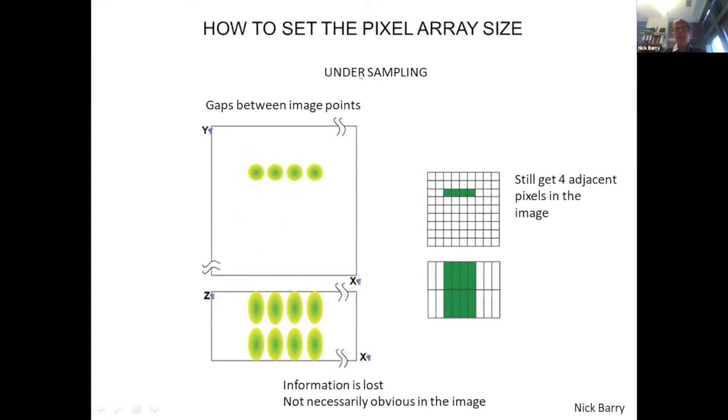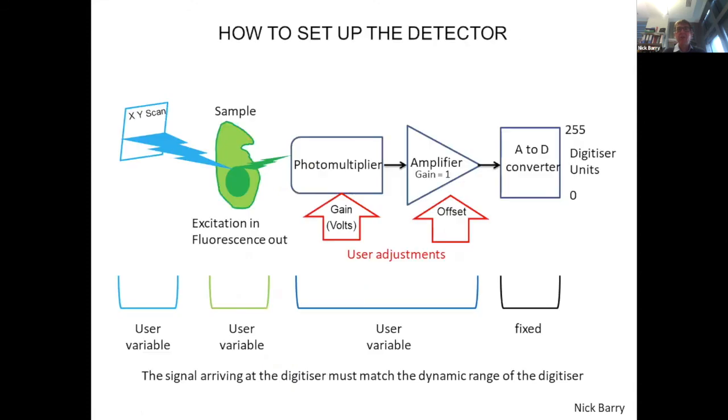Fortunately, the microscopes now basically have a button that optimizes the scanning for your particular choice of wavelength and objective setting, and likewise will optimize the pinhole setting for you. There's a whole bunch of points from scanning your sample with a laser, up to the digitized signal that gets displayed on this computer screen. So this is why you get training.